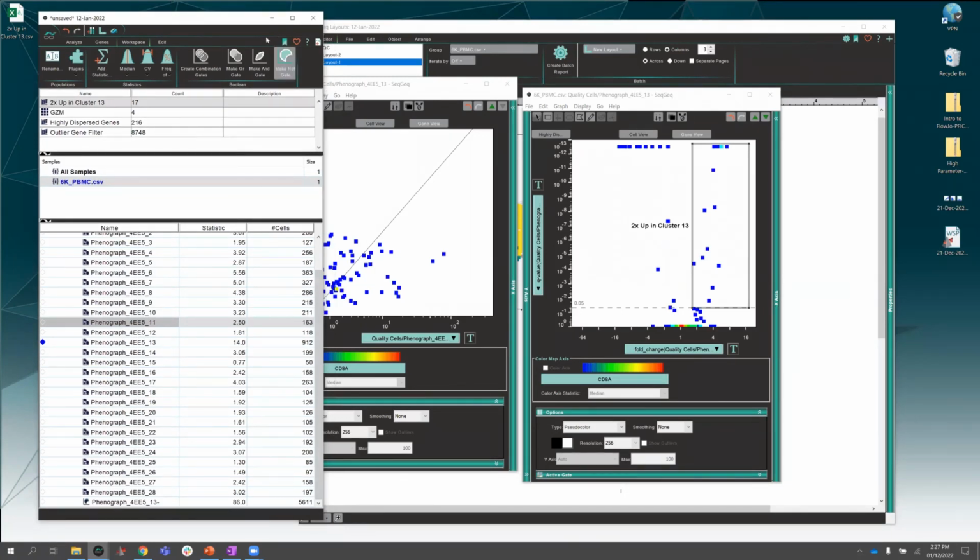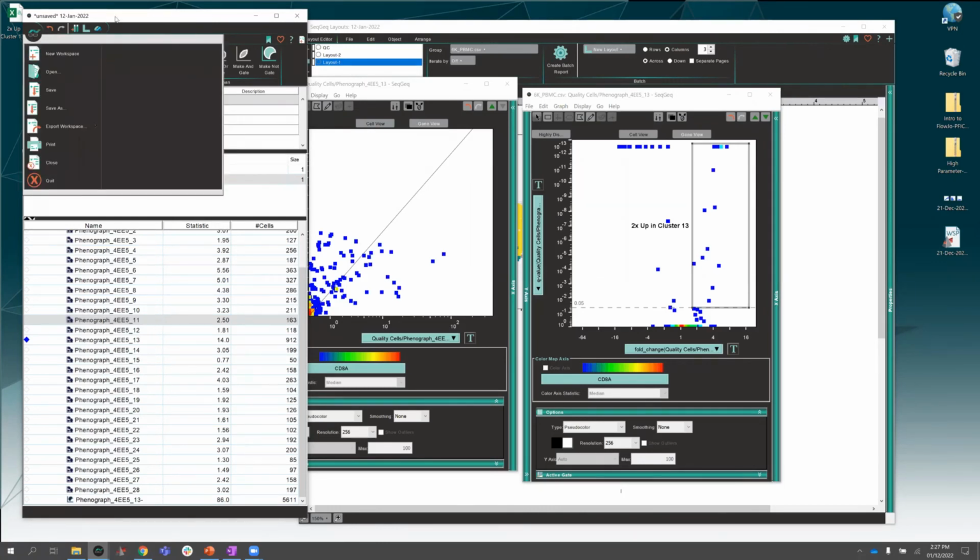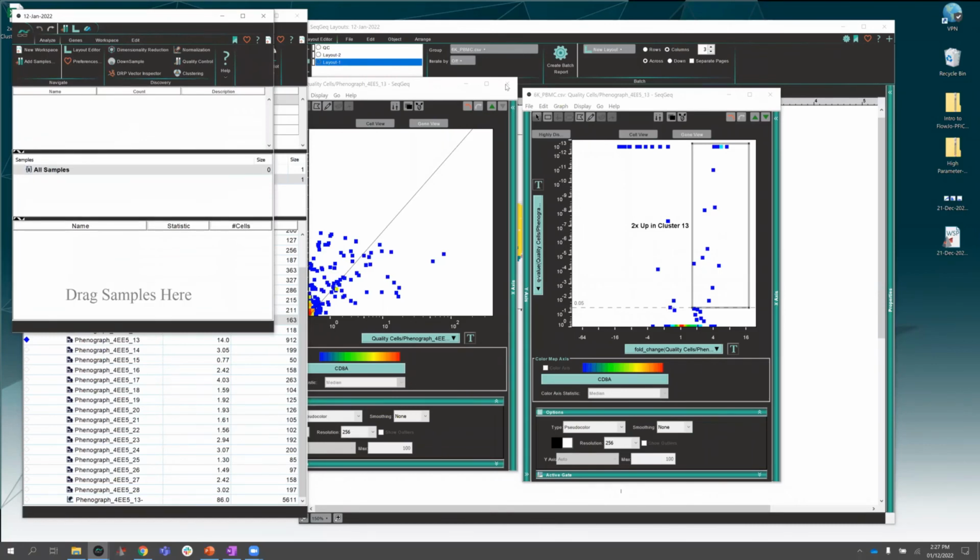All right, so I think that is all that I wanted to cover today. I will quickly show the ISLR plugin just to show that it can help automate this gene set formation. So I'll go ahead and just open a new workspace to show you what happens when that launches. Let's go ahead and close some of that stuff.